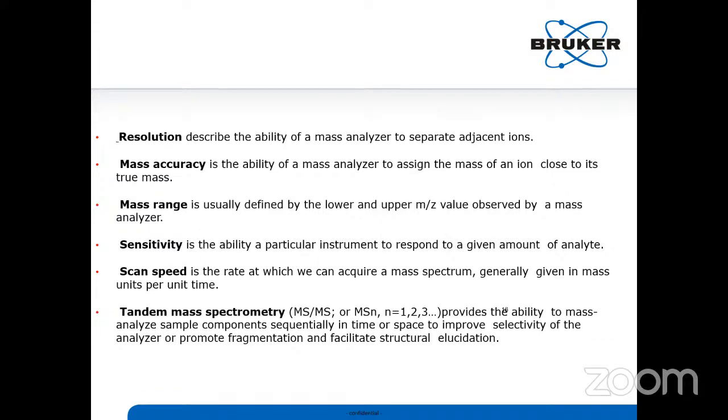But when you are analyzing closely spaced species, for example, if you did the digestion and got very close peptides, one around 200.25 and another around 200.45, your mass spec should be able to separate them.